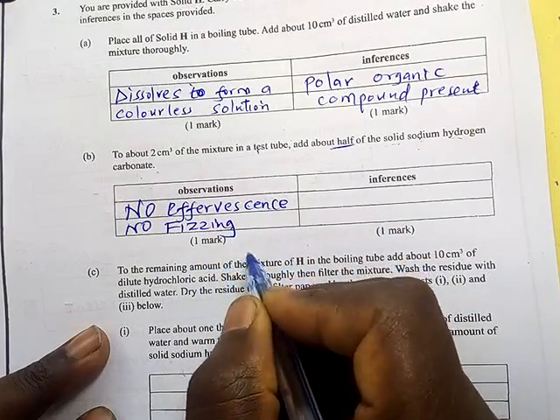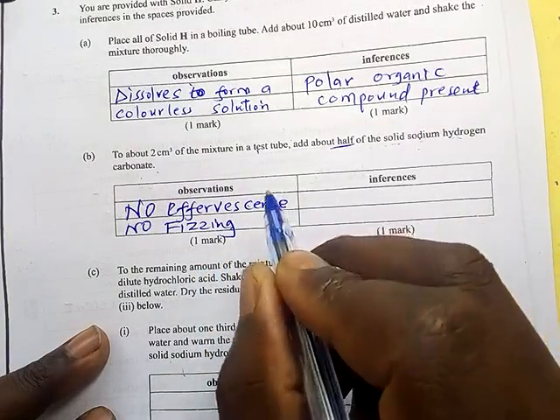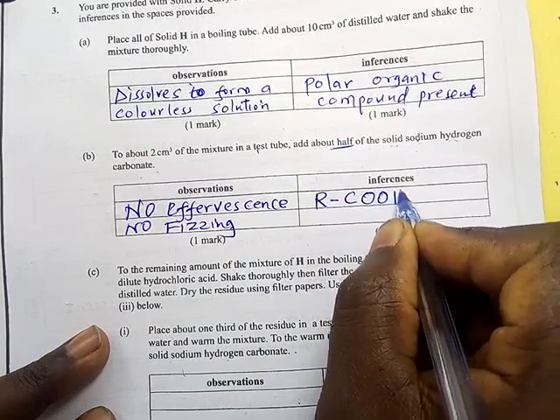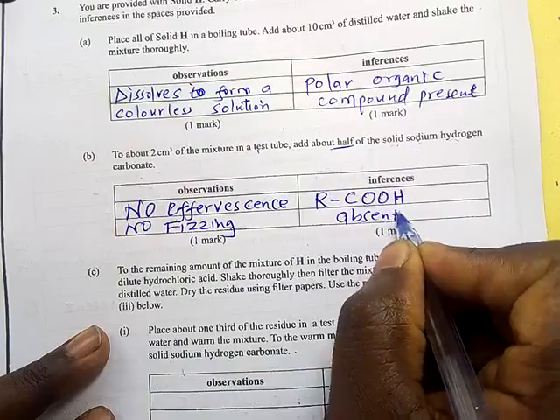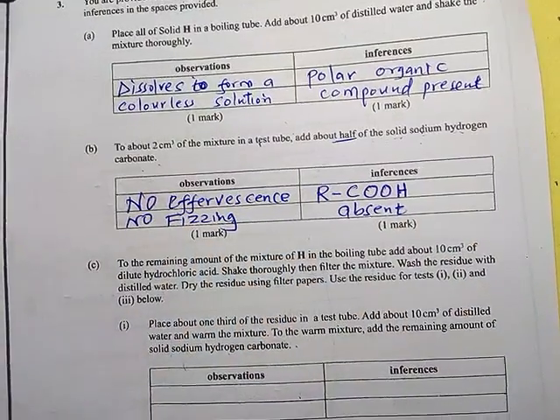So it means the organic acids are not there. We use RCOOH to represent organic acids. So it means it is absent, because there is no effervescence.